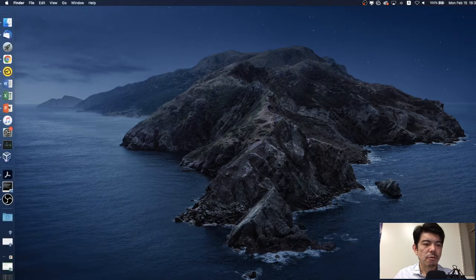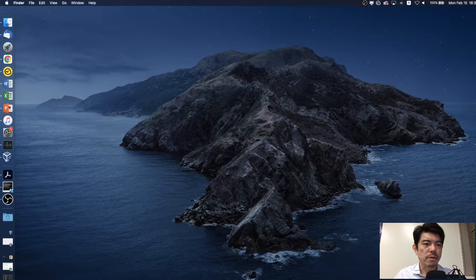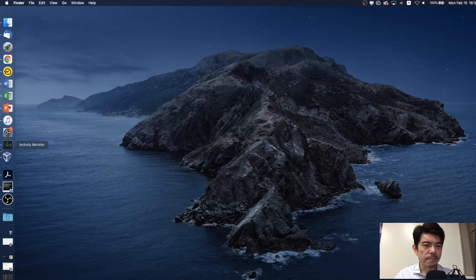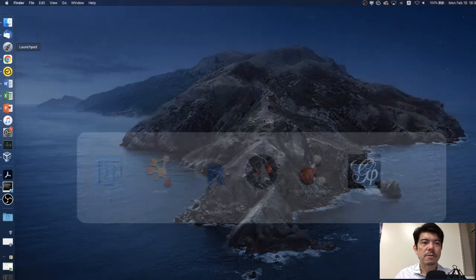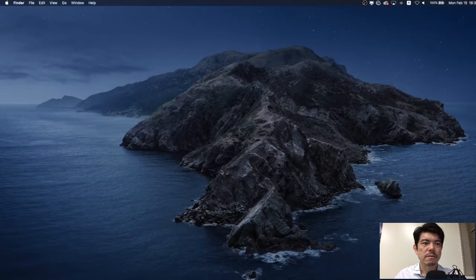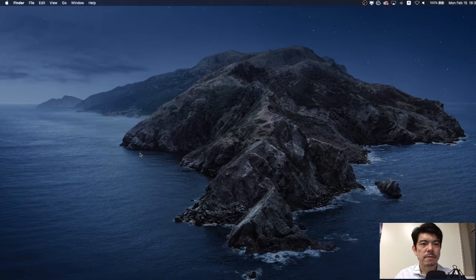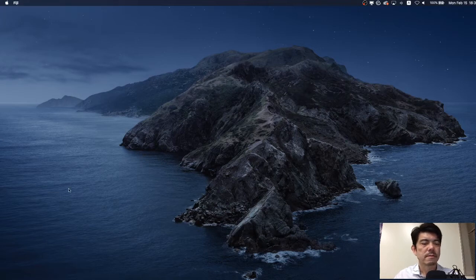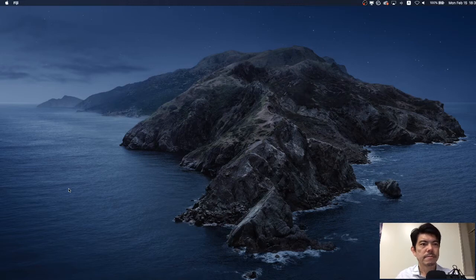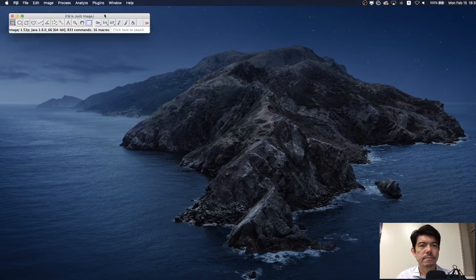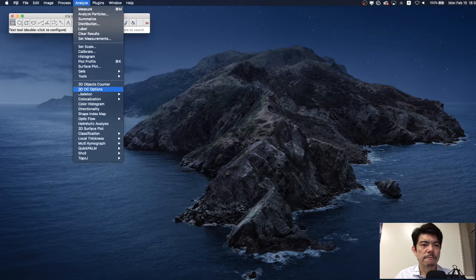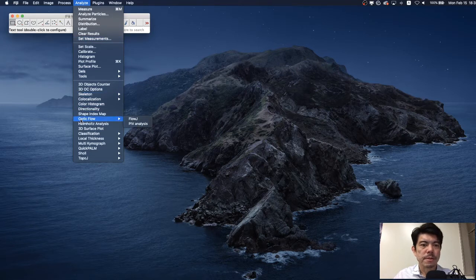Actually, I already started ImageJ but after you installed the jar file you have to restart ImageJ. Okay, it's going to take some time. Alright, so at first, let's see if we successfully moved the jar file.